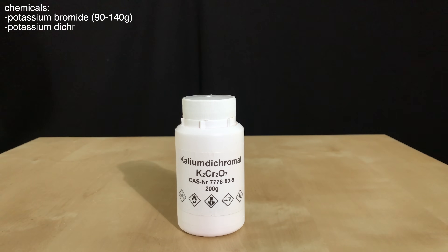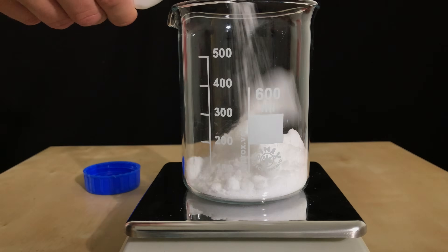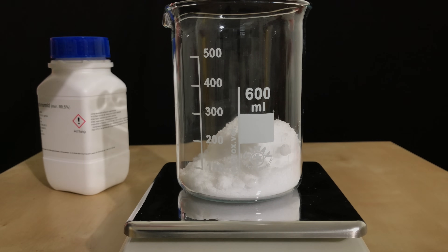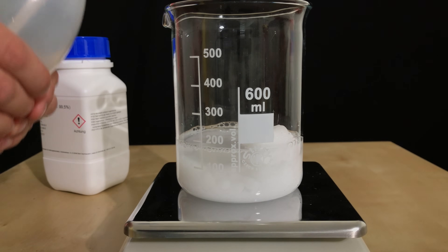For the first test we are going to need a small pinch of potassium dichromate and a lot of potassium bromide. A stir fish was added to this beaker and we then weighed out about 100g of potassium bromide. The amount of distilled water used doesn't really matter, so we ended up filling up the beaker to the 400ml mark.